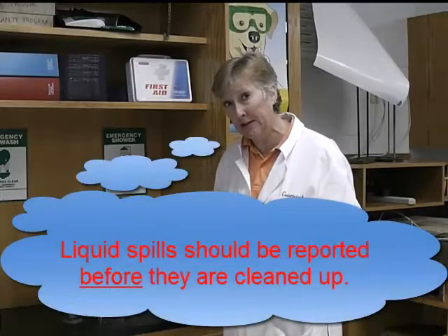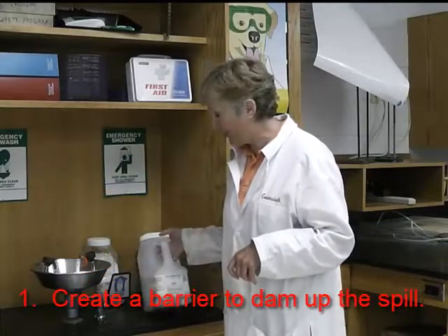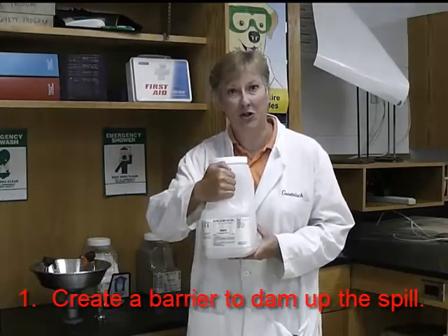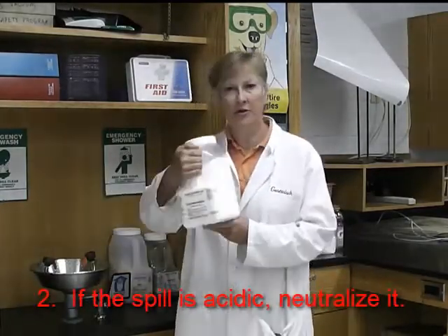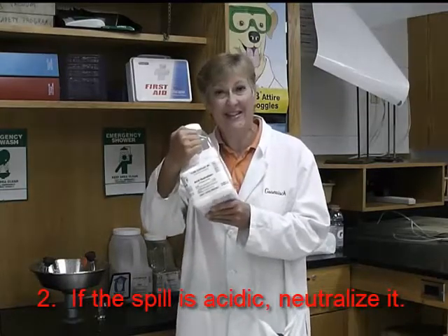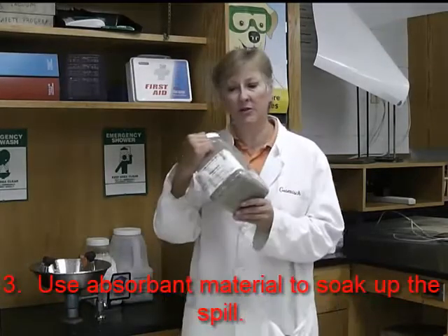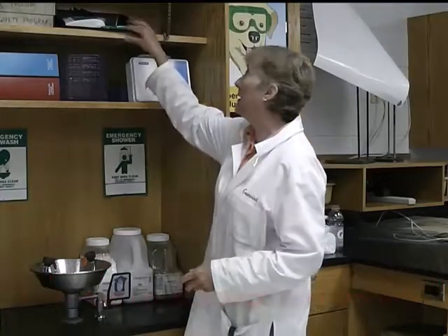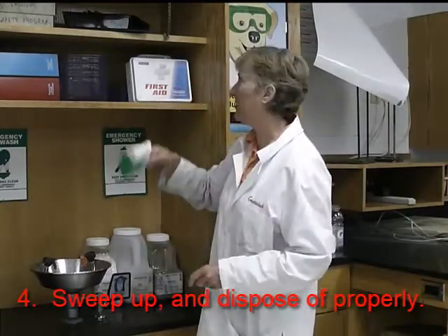For liquid spills, it is a three-step process. Step one: use sand to make a dam around the spill so you can contain it in a certain area. Step two: if it's an acid, use the acid neutralizer; if it's not an acid, you do not have to do this step. Step three: use an absorbent so it can absorb or suck up the liquid. And finally, use the dustpan and broom to sweep it all up — that takes care of the spill.